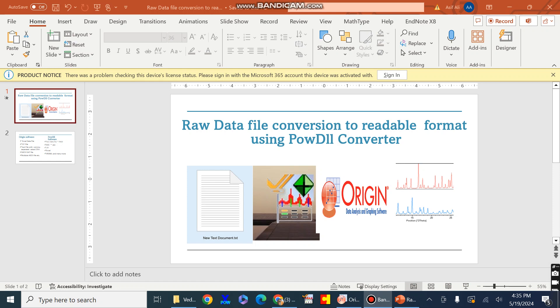In this video I will discuss the raw data file conversion from a non-readable format to a readable format using the PowDLL converter. As we know, in order to draw XRD raw data files we mostly use the Origin software, and there are certain files which can be drawn and plotted with the help of Origin software. However, there are multiple raw data file formats which cannot be supported by Origin software.